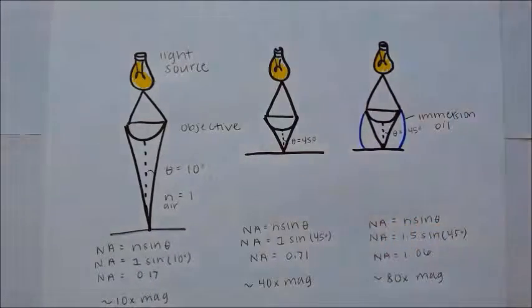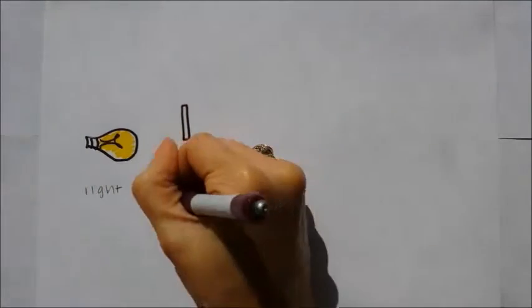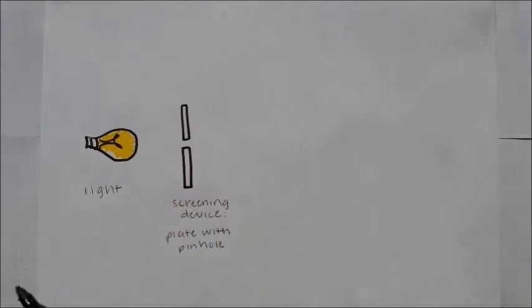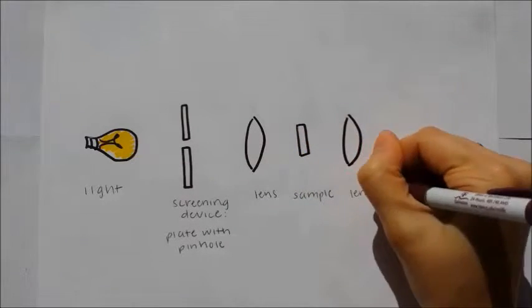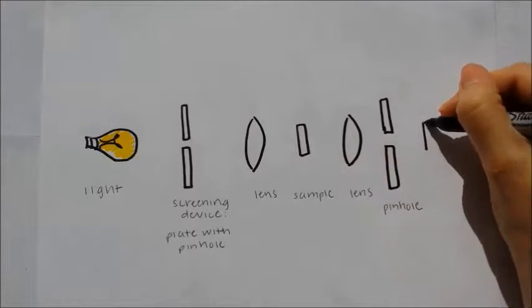In 1957, Marvin Minsky patented the first double-focusing confocal scanning microscope, which included 2 lenses and 2 pinholes. Since the power of resolution of the microscope depends upon the degree to which a geometric point can be approximated, the first screening device was imperative to produce light from a point source. The objective, or the first lens, focused the light emanating from the first pinhole upon the sample to produce an illuminated point. The second lens focused the illuminated sample point upon the second pinhole, which in turn only allowed the most focused light to pass through to the detector. Minsky's design didn't attract an extravagant amount of attention.